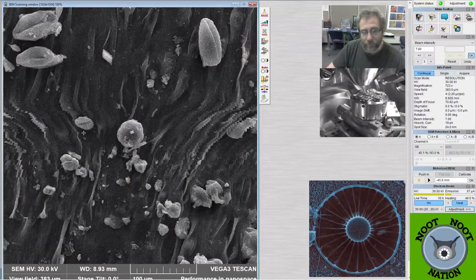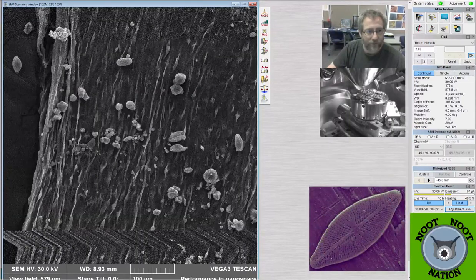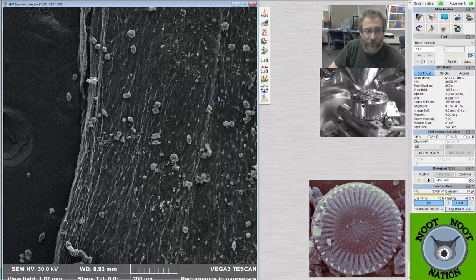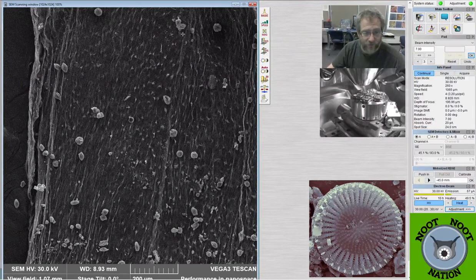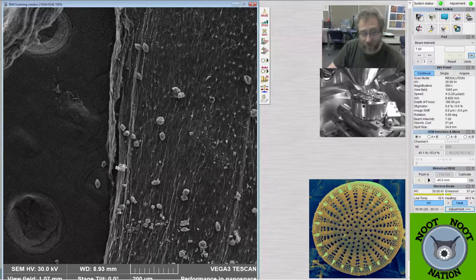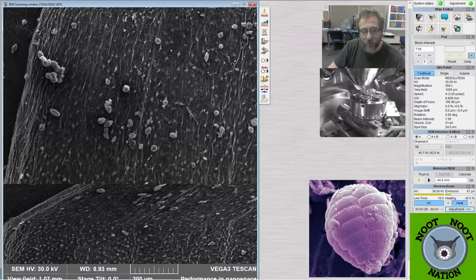I have nice Pentaviews that I use in my lab that can get you up to 600 times magnification. They're not DIC or anything like that, but they don't have eyepieces, just a camera mount. Some people don't like looking through microscopes because they get a headache from the lenses, so that's nice. You can take pictures and do little videos very easily. I think those microscopes cost maybe $300. In that range, you can get a pretty decent microscope with pretty high magnification images. It just depends on what you're interested in spending.